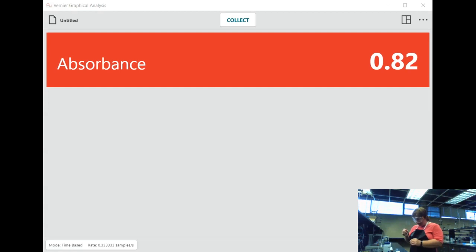In this particular case, now that I picked my maximum wavelength, I'm not changing the wavelength anymore. I'm just changing which solution I'm measuring. Put the top on. Clean the sides. A lot of times when you're changing out the solution of the cuvette, it gets dirty on the sides, drippings. So wipe it off. Make sure the clear side is aligned with the arrow. Close it. So I would record dilution number 1.